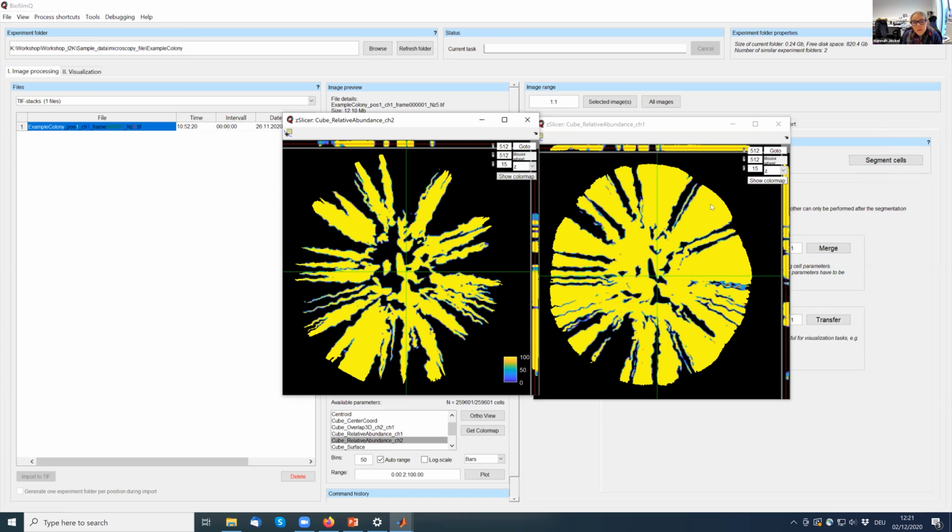So here we can see, again, we have this very distinct, usually the cubes, except for these areas at the border where they are not yellow or black. Most of the cubes are actually either 100% one color or 0% that color. And this is important to know.